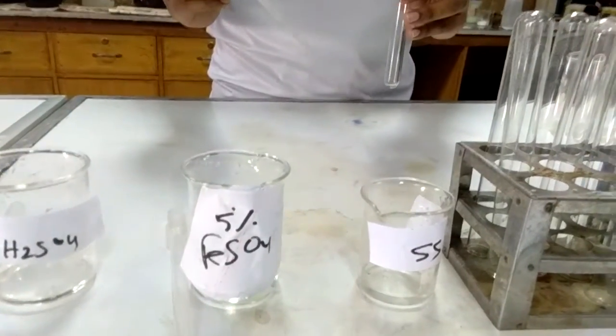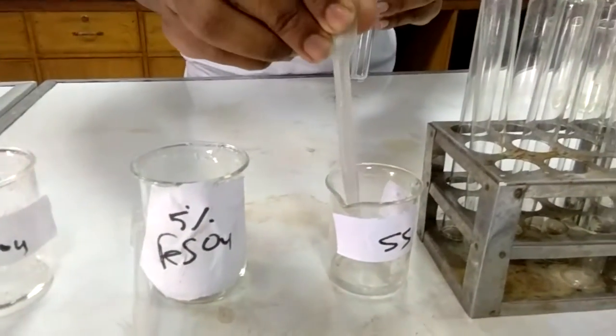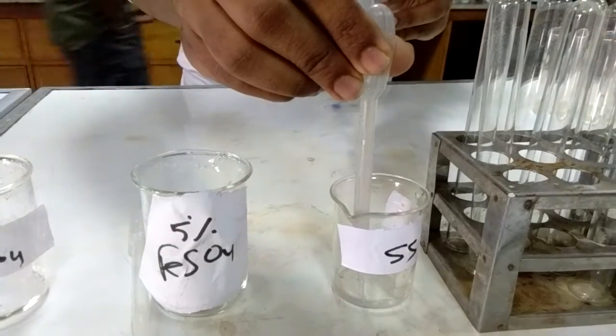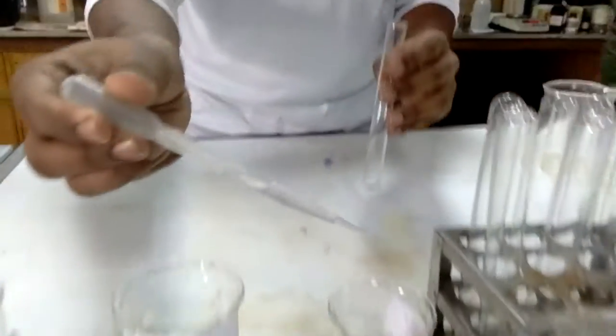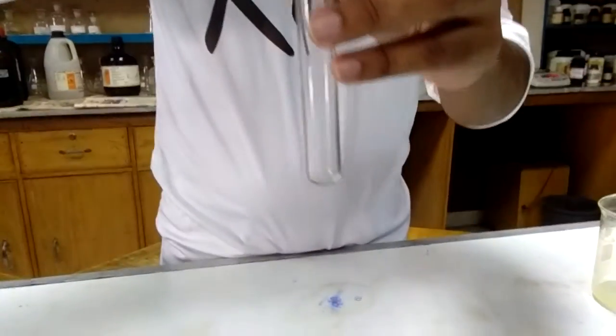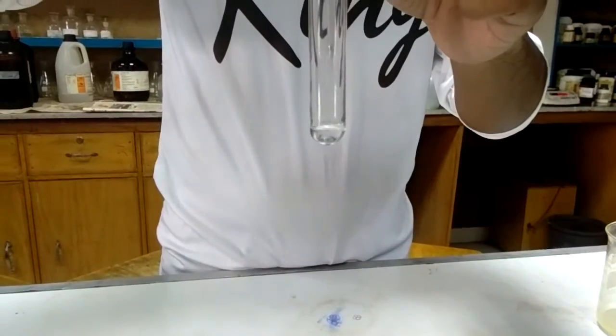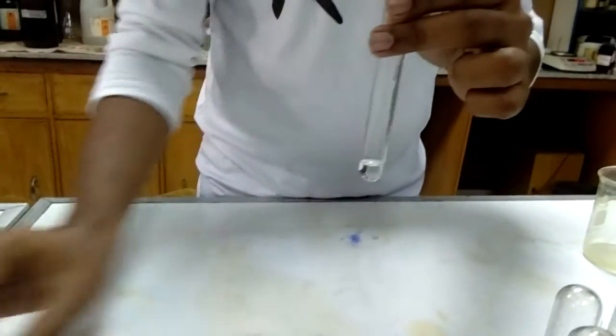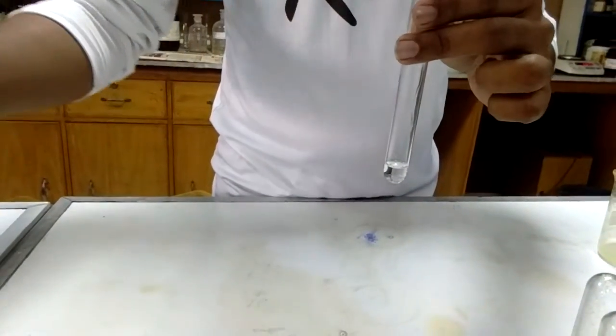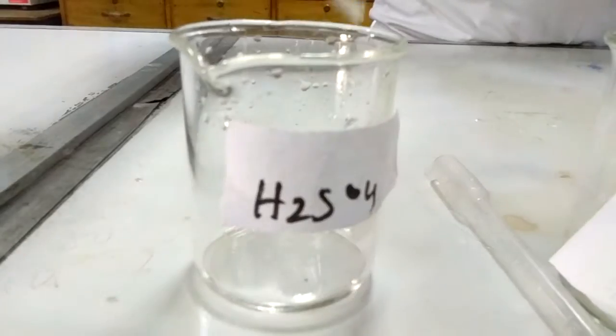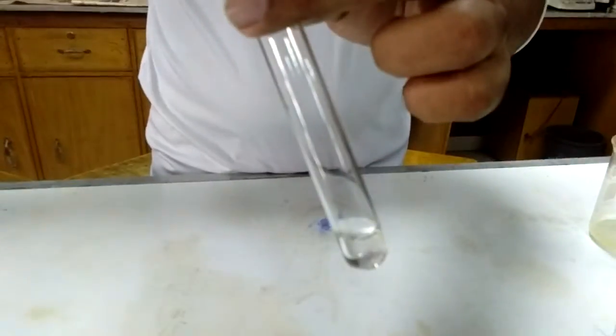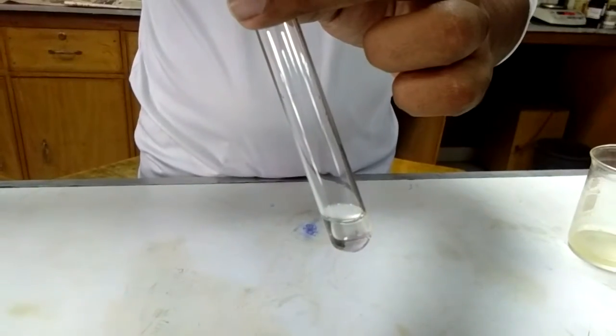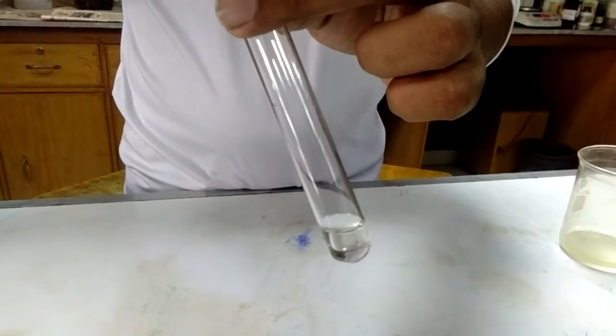This is the ring test for nitrate ion. At first, 2 ml of the sample solution is taken in the test tube. Then, inside this sample solution, in the ratio of 2:1 - that is, for 2 ml sample solution, 1 ml concentrated sulfuric acid is to be added.